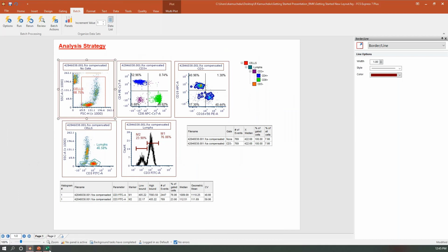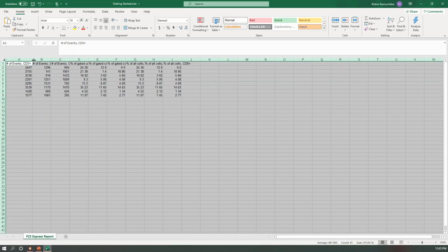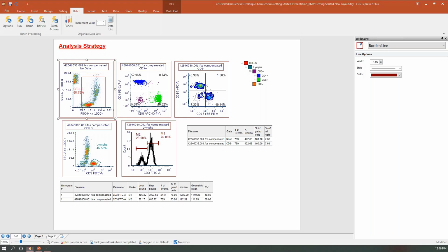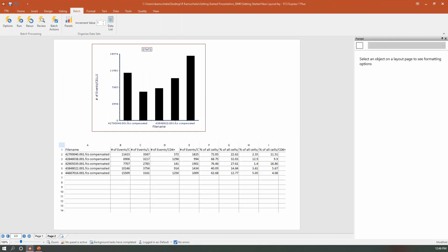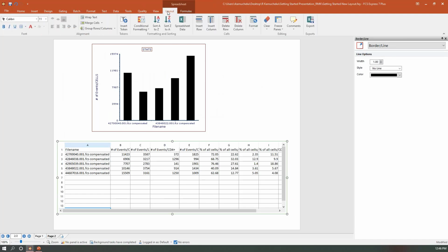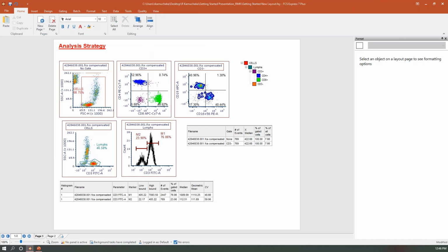Let's go ahead and open that Excel file back up. All those elements that we had exported are now listed in Excel. So if we wanted to do anything additional in our Excel sheet, we could just pick up from where we left off from that export. I should mention that our spreadsheet itself, you can export that from the tab. What I mean is, when you have this spreadsheet, we get 2 additional tabs here. We get a layout tab that gives you some conditional formatting, some formatting fun stuff to look at. And then we also have our formulas tools, which give you the functionality and those formulas to really do that advanced statistical analysis.